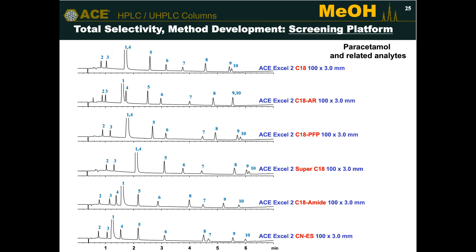For unknown samples, unknown compounds with LC-UV, it's a bit trickier if you don't have MS available, but you can still do it because I've done it for many years that way too. You use different column chemistries and you use peak area and try to map between the different elution and retention times, and match the peak areas as best as you can when you have unknown compounds. But in an ideal world, especially for unknowns, you really do need ideally a single quad LCMS instrument. Of course, anything more powerful than a single quad is great if you have that type of capability in your lab.